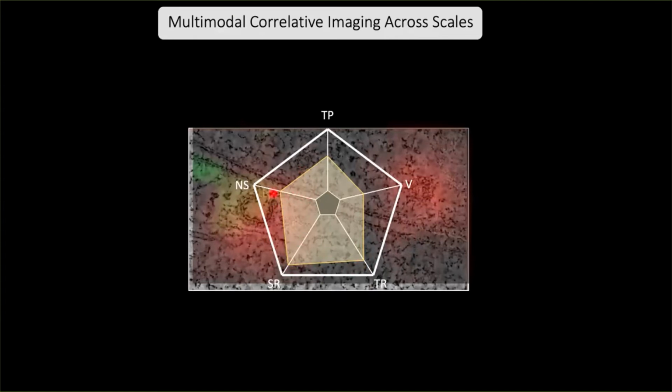In terms of the native state, we've cryo-immobilized, so that's already good, but then we impregnated the cells with resin. So I would assume we're slightly moving away from the absolute best. The throughput is also quite high because we are targeting, but the volume is only 300 nanometers. So we are really looking at very restricted areas of the cell membrane and the cytoplasm.